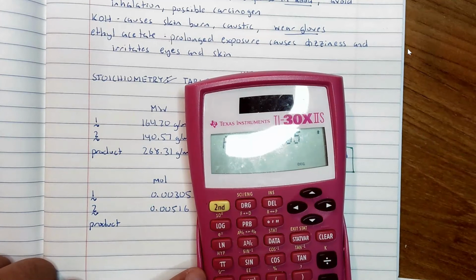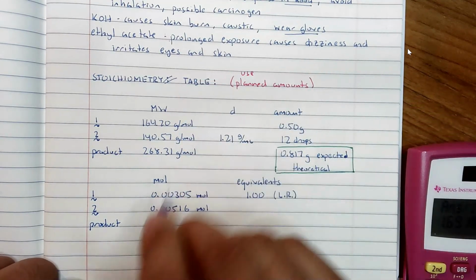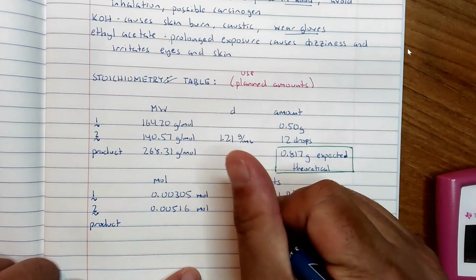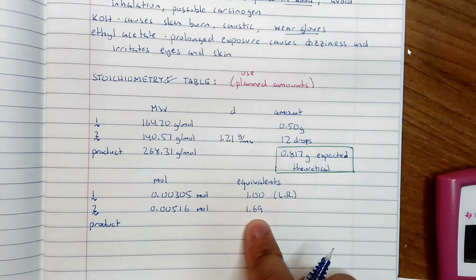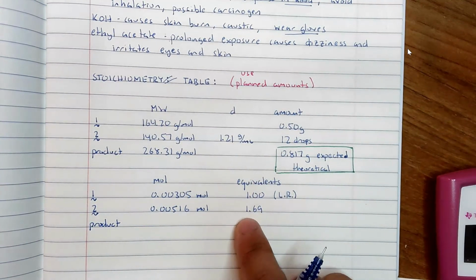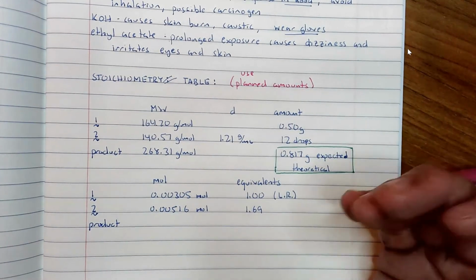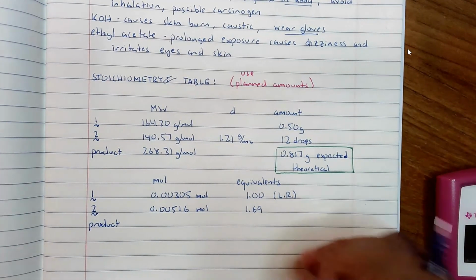So I'm going to press enter. 0.69. Good. No, not 0.69, 1.69. But that's good, because I estimated that this number should be bigger. So it wouldn't have made sense if I wrote 0.69. Okay, so that's the equivalence. So it's about 50% more than it needs to be.